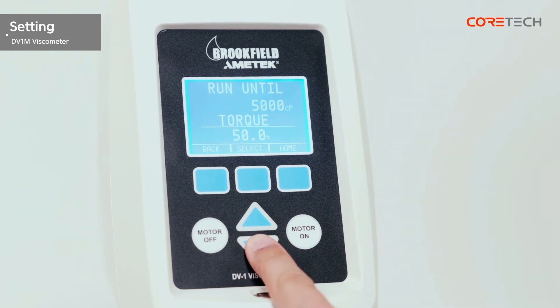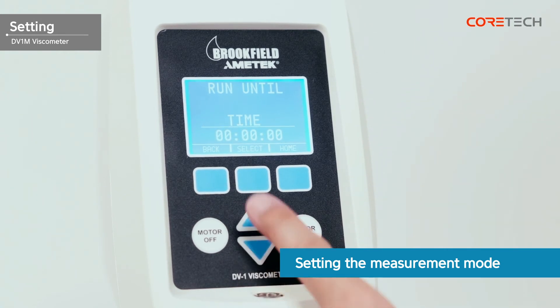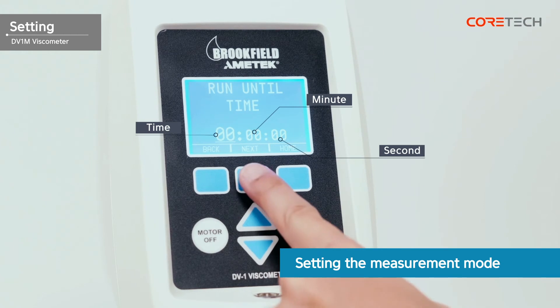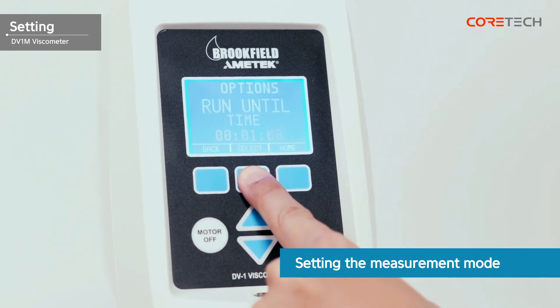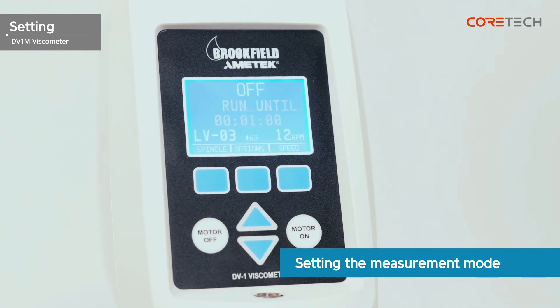Let me explain the time mode, which is commonly used. To set the measurement time, press the Option button, then press the Select button in the Run Until menu. Use the arrow keys to select 'Time' and press the Select button again. The following fields are hours, minutes, and seconds in order. You can set the time up to 99 hours, 59 minutes, and 59 seconds. Press the Next button after setting the hours, then again after setting the minutes, and press Enter after setting the seconds. When setup is complete, press the Home button to return to the measurement standby screen.